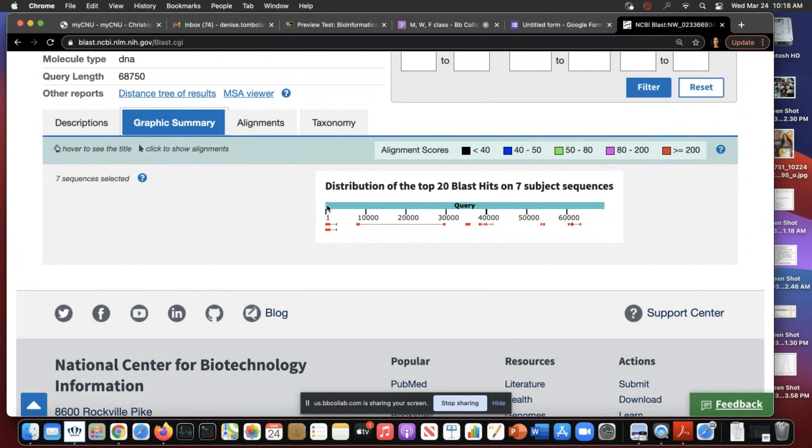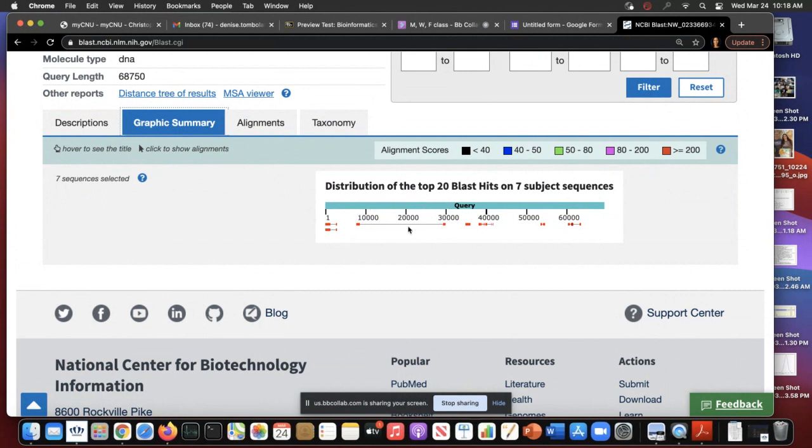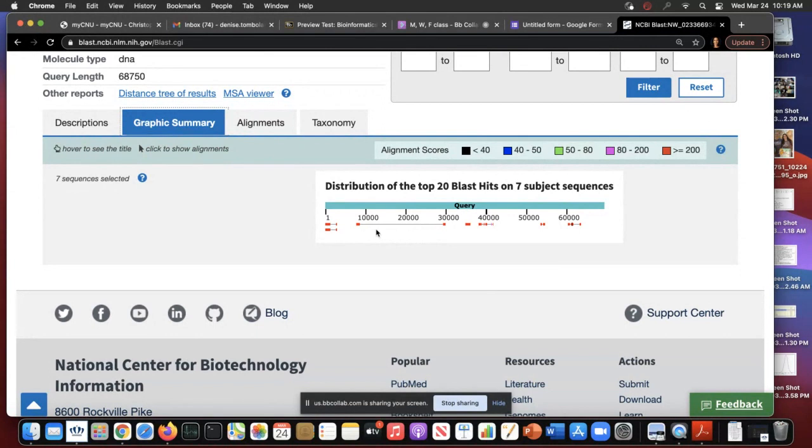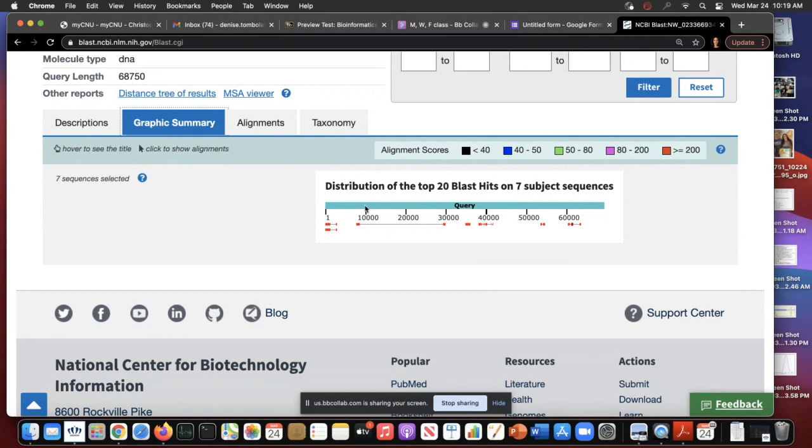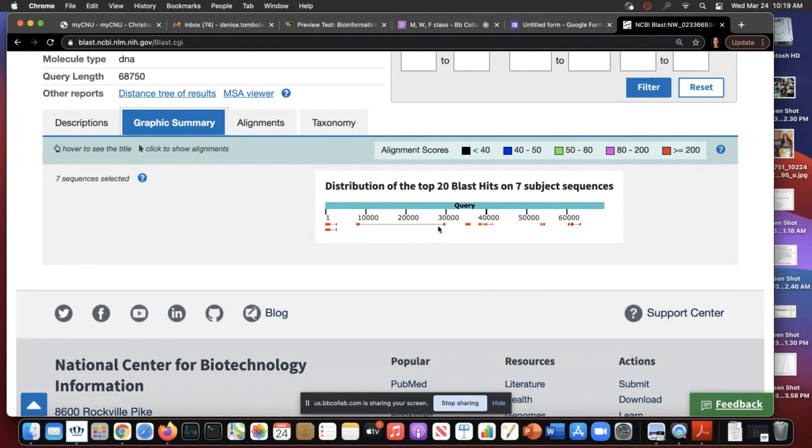There is one gene here, one gene here, this whole thing is a second gene. But what's this thing? This is either a really big intron because this is one mRNA molecule that matched this part of the sequence, but the part that matched was only here and here. And this middle part didn't match. It could be because the DNA sequence here does not show up on the mRNA. Therefore, it's an intron. Or it could be that this sequence here doesn't match that part of the mRNA. There are ways of finding that out, but we're not going to go into that much depth.